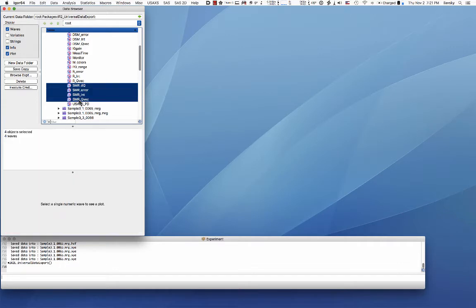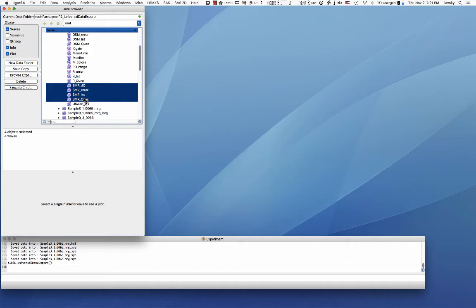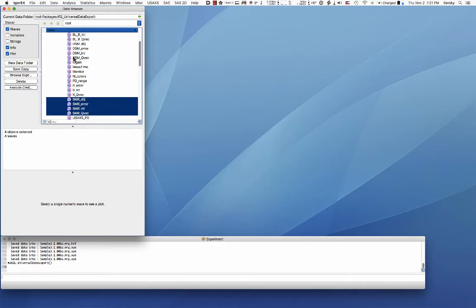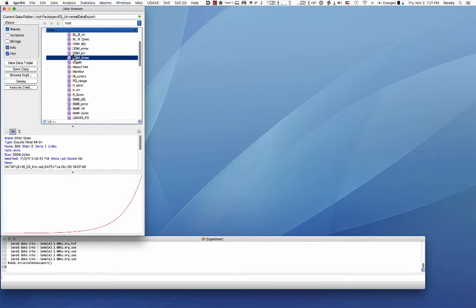The problem is as far as I know at this time November 2017 no other piece of software in the world can reliably model slit-smeared data from our instrument. I don't believe anyone has all the necessary setups or conditions or configurations available. So there's another choice. You can either de-smear during data reduction or you can de-smear separately as a separate tool in IRENA.